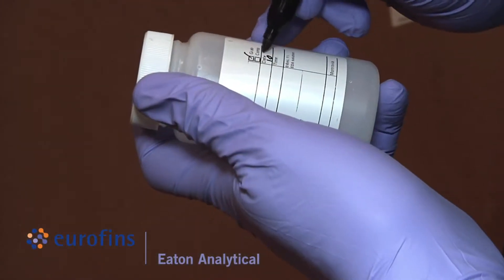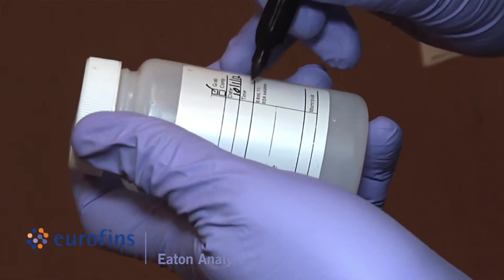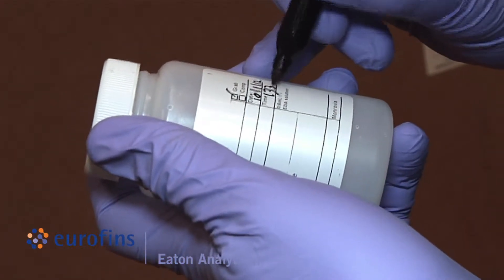Before filling, label bottles with required information that is not already pre-printed, such as the sample ID, date, and time of collection.